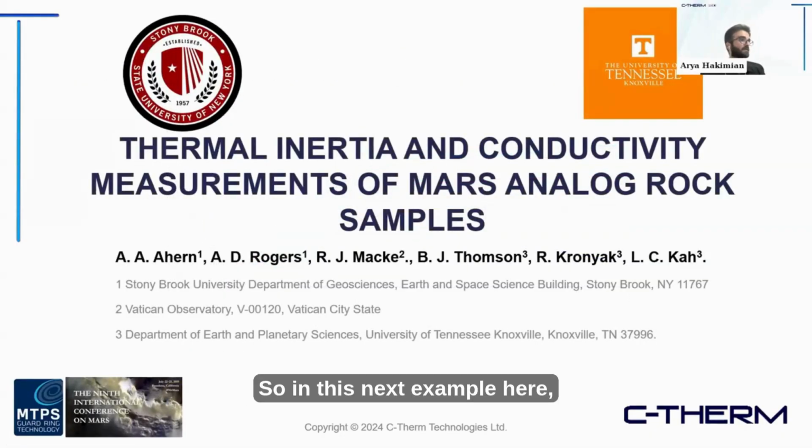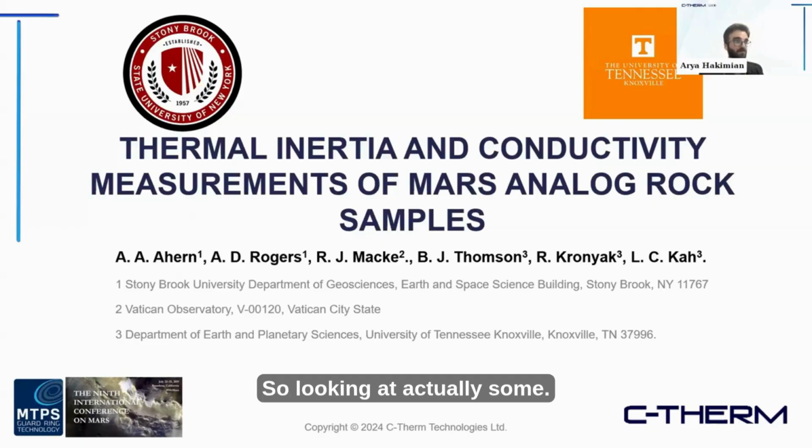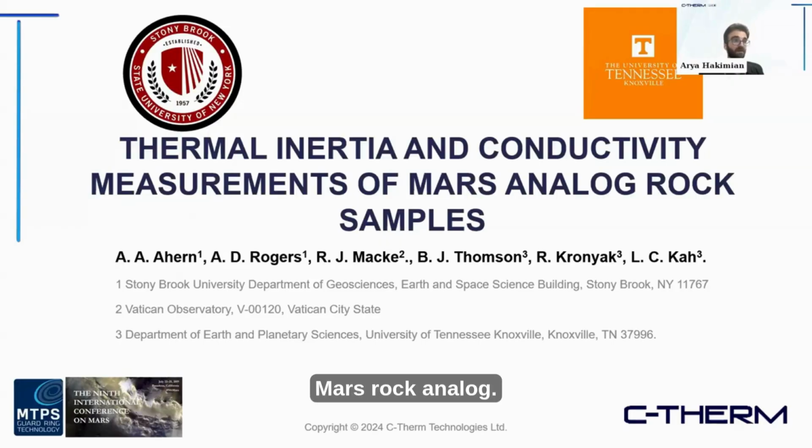So in this next example, this is some nice work. This was published at a conference, the 9th International Conference on Mars. So looking at applications of thermal measurements of some of these Mars rock analogs.